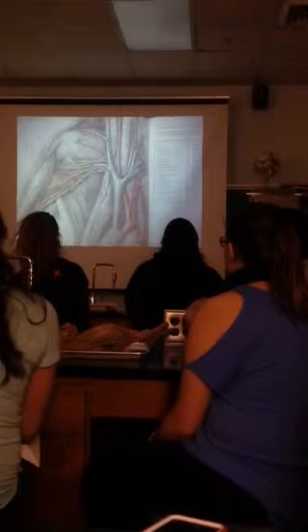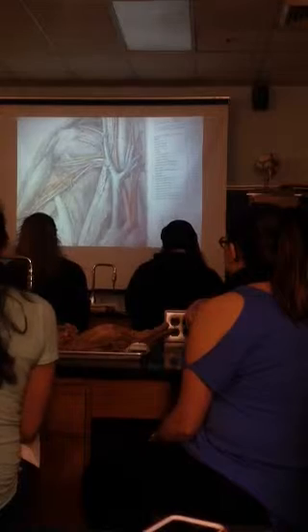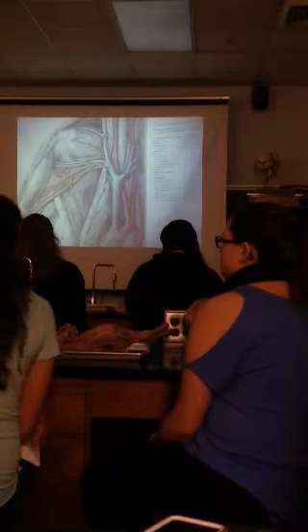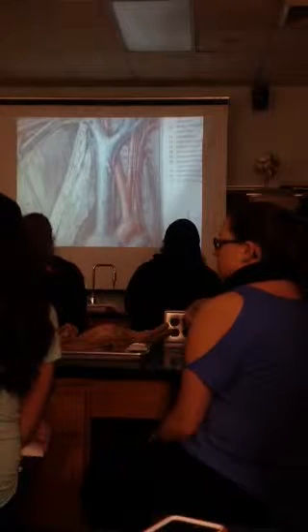crazy. Okay, so I like this picture just because it's, again, we're doing patterns before we cross over and apply it to the cat itself. So we're going to start right down here and move our way up. Okay, so heart, we have ascending aorta right there, right? Okay, and then we go up into, it's kind of weird.